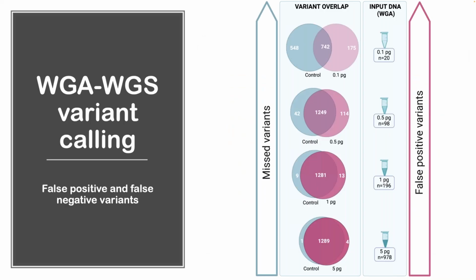Next, we wanted to know whether whole genome amplification WGS samples accurately reflect the genomic variants identified in the control sample at the nucleotide level.